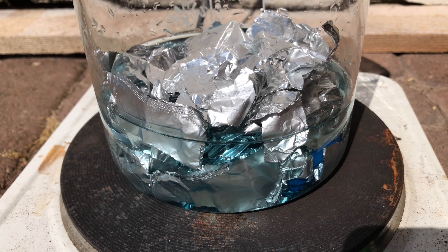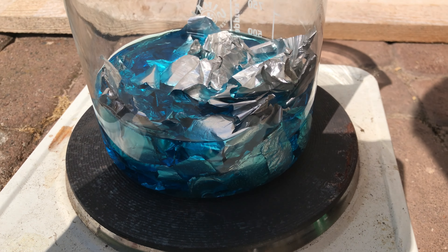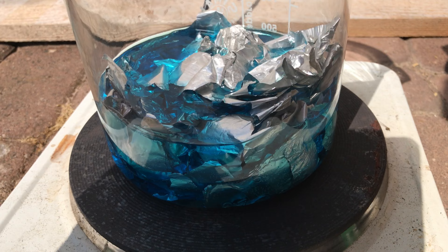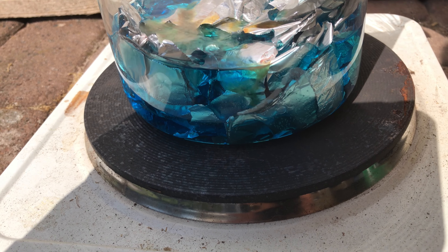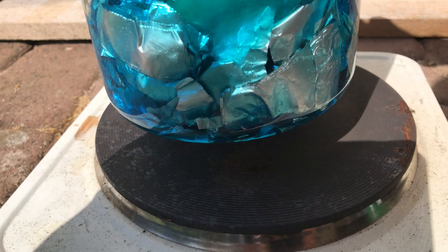We began by heating everything up to dissolve all of the copper sulfate, and then I took whatever mercury salts I had on hand. Without having to open my poison box, I took this Mayer's reagent, which is potassium iodomercurate. It's a somewhat dilute solution, but you don't need a lot of mercury for this.